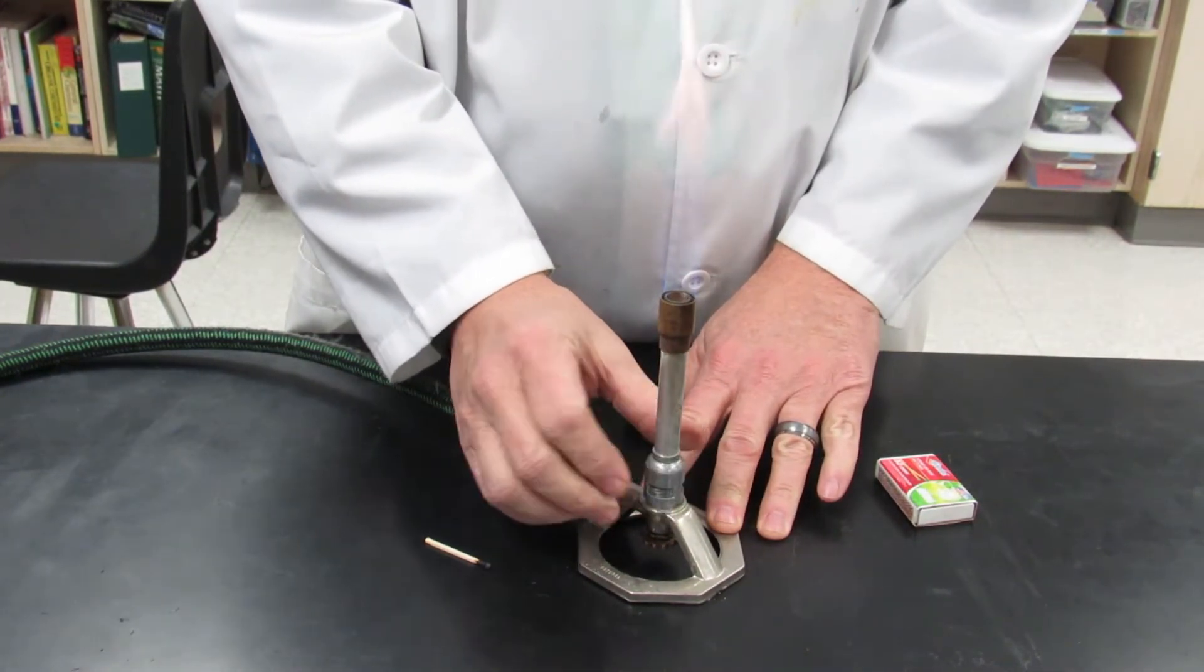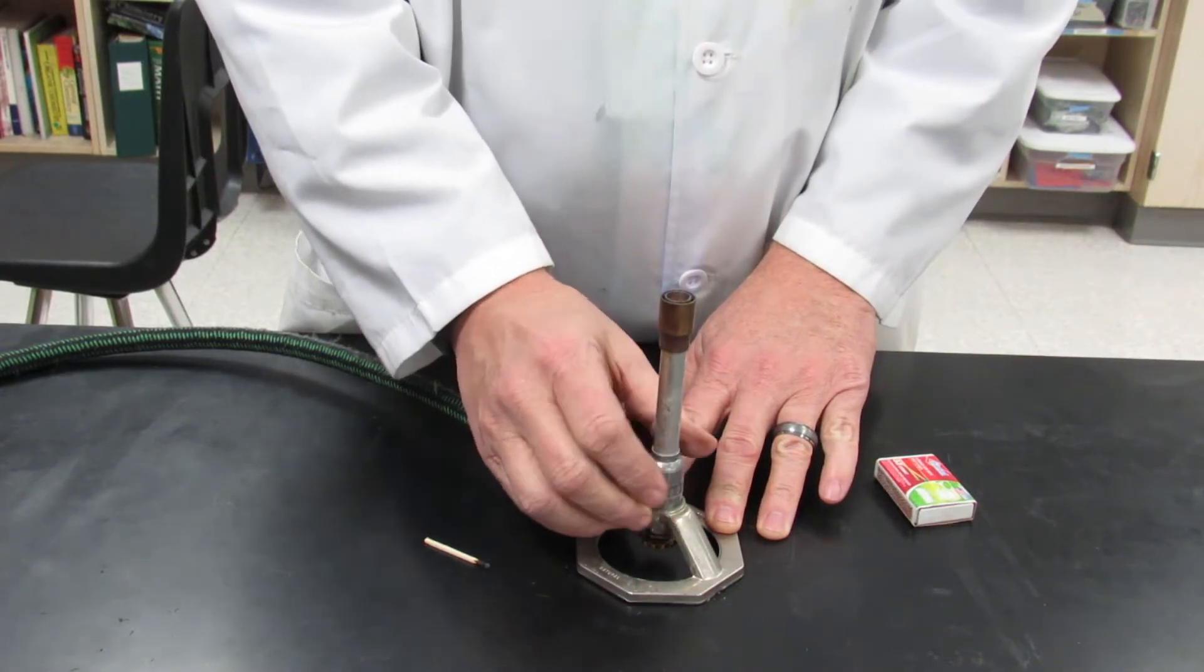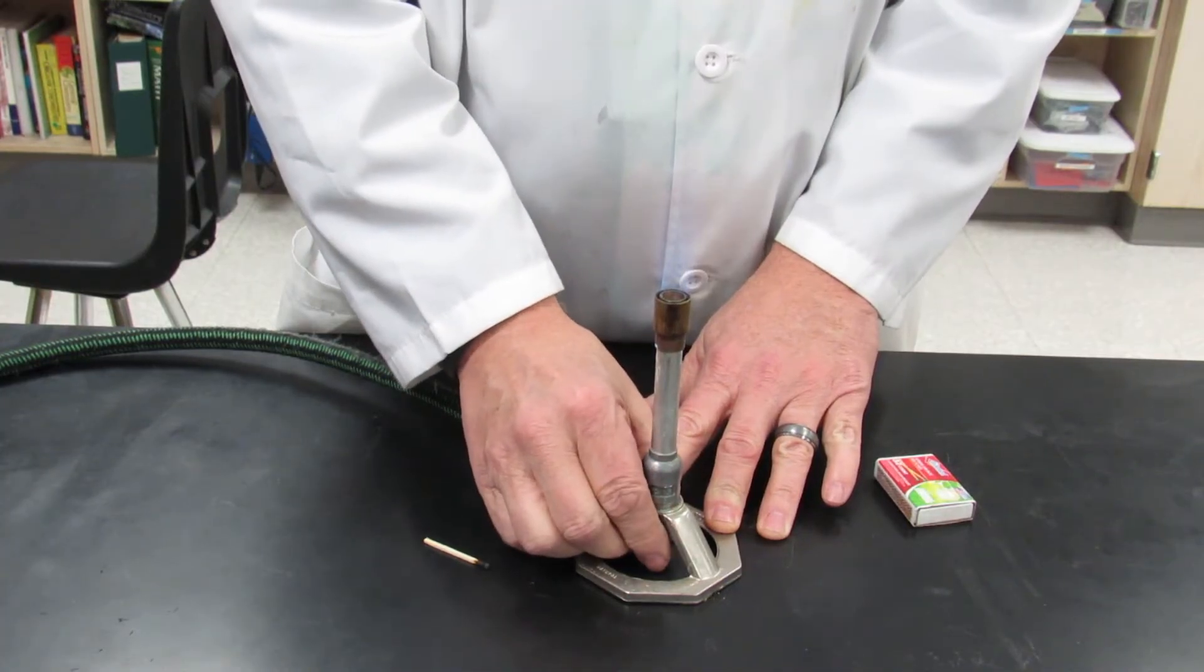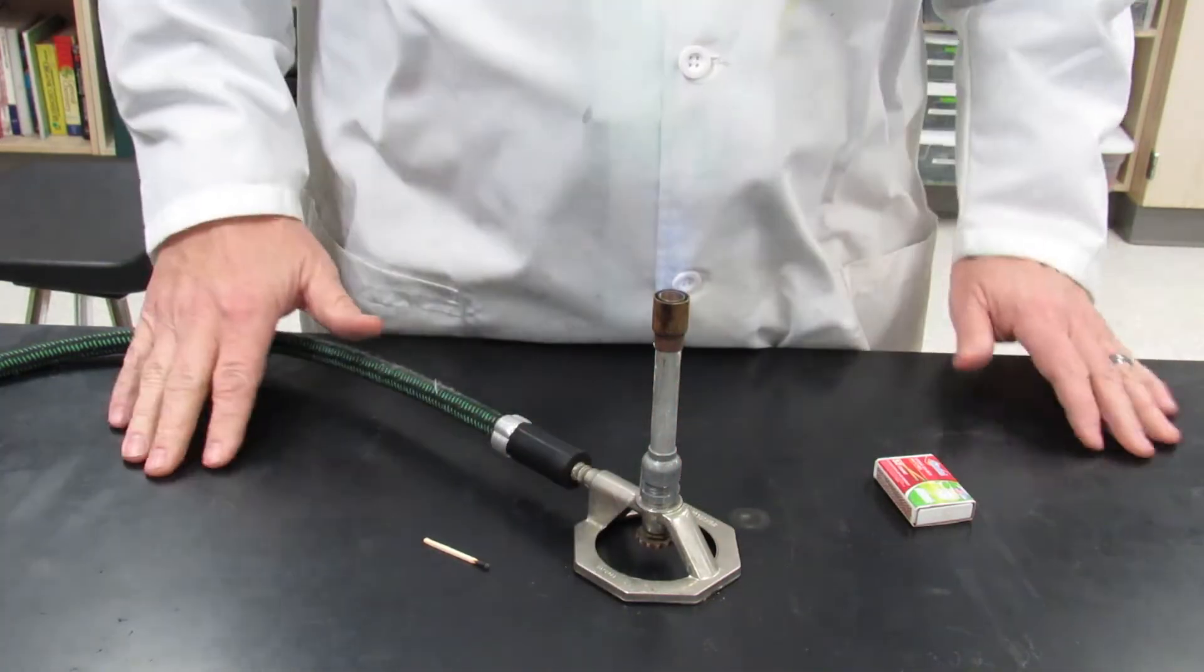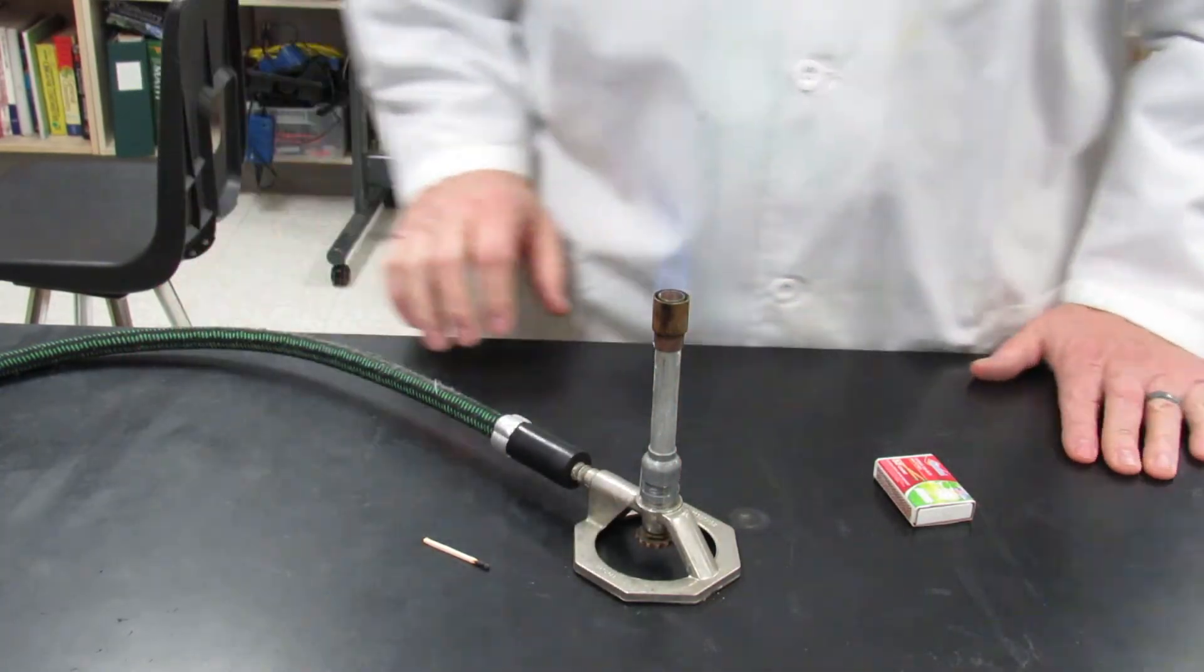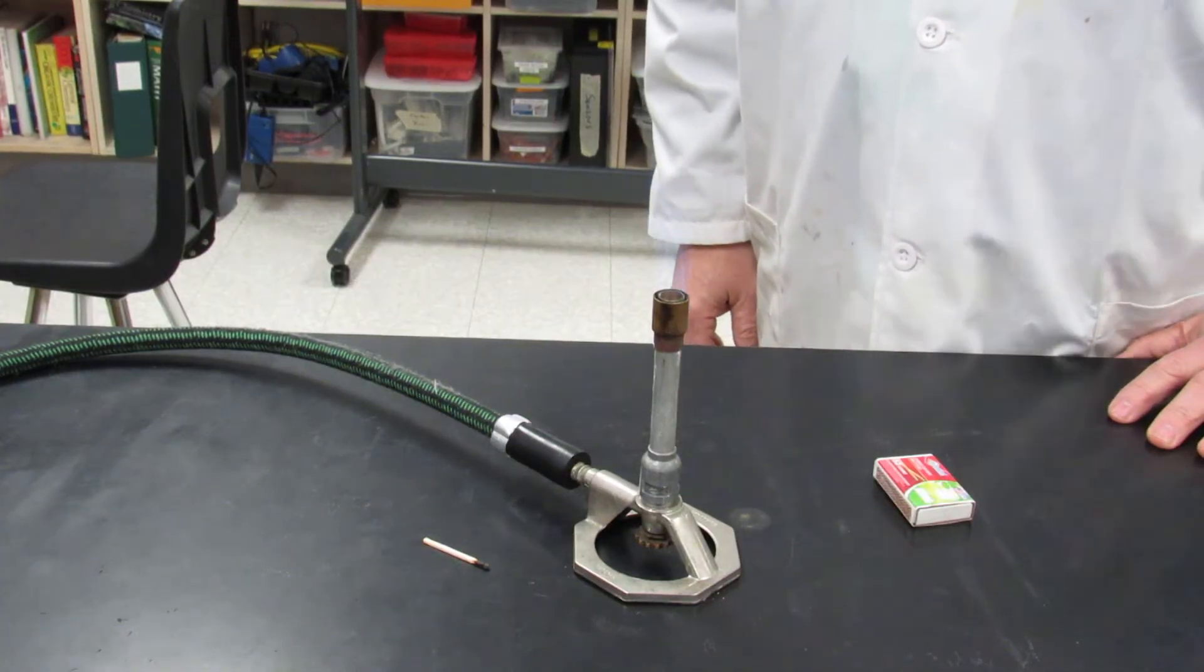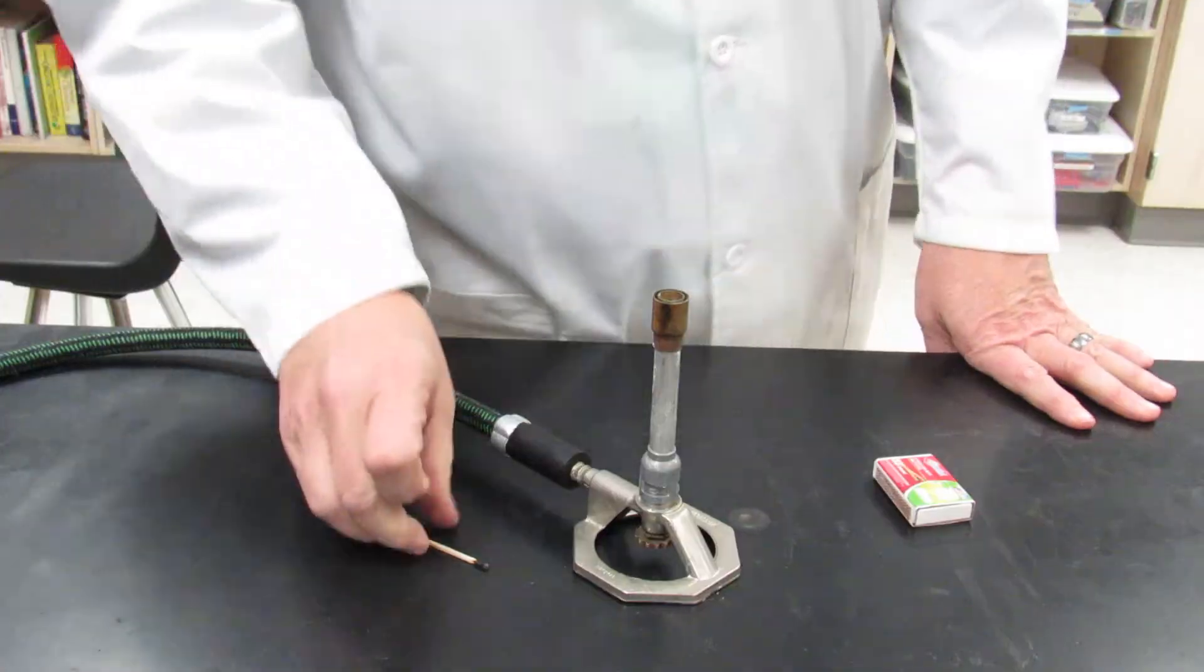Turn the barrel counterclockwise until you get a nice blue pointy flame. You may have to adjust the gas a little bit to turn it down or up to get a nice pointy blue flame. You can see it against the background—that is the way you need to light the Bunsen burner.